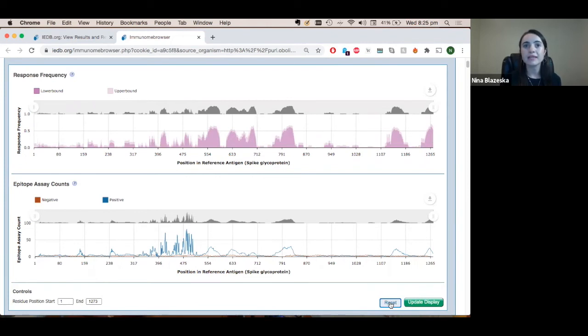And apart from this, there are a few other areas that are fairly immunogenic. So again, I'll hover, but some examples that we have: residue 530, so we're looking at around about here, to residue 600. That area is quite immunogenic. We see from 612, which is just around here, to 659 here, that area is quite immunogenic.